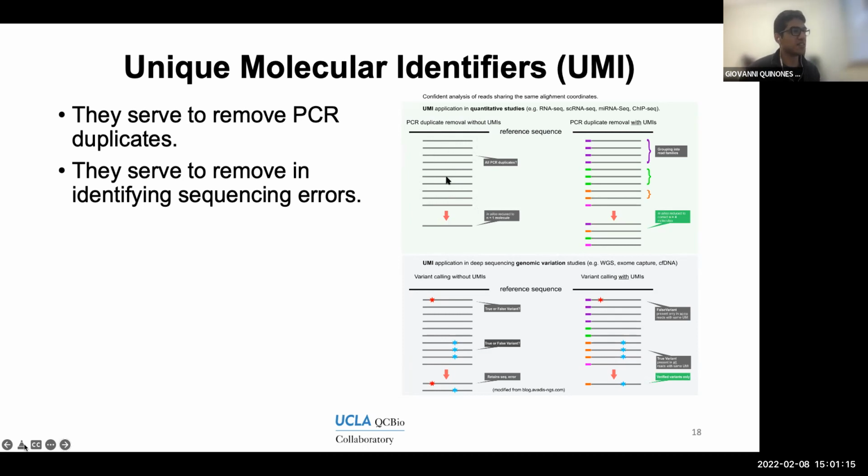Statistically, it is very unlikely to have this many reads stacked with the same coordinates. So most of the time, we assume they are duplicates of one original molecule. For this whole stack of reads, we just select one and discard the rest, because we consider them artifacts due to some error in the PCR.